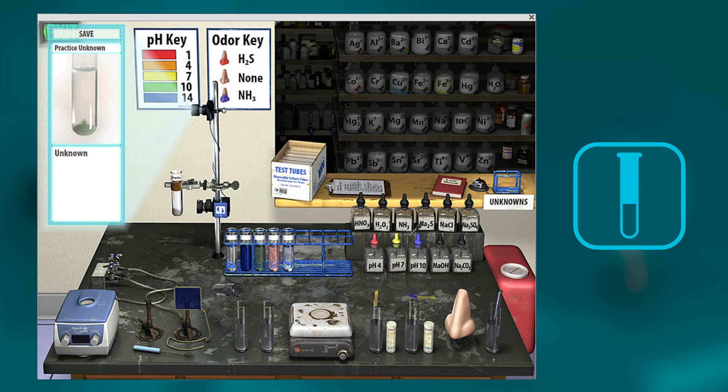Now we're going to add ammonia. Hmm, what does that color tell you? So now we can centrifuge decant. What does that color tell you? What do you think you have there?